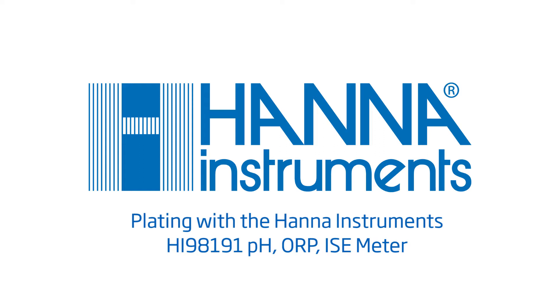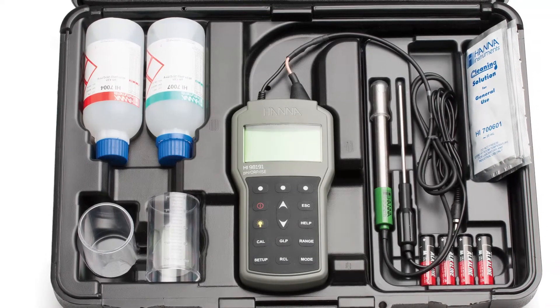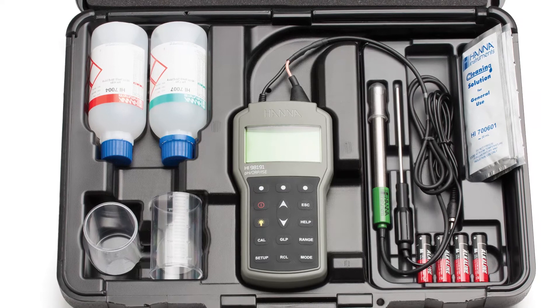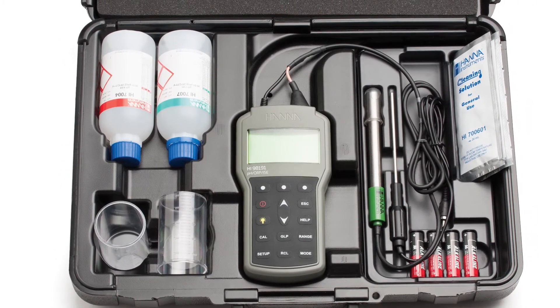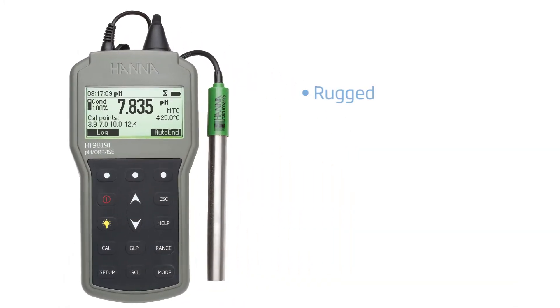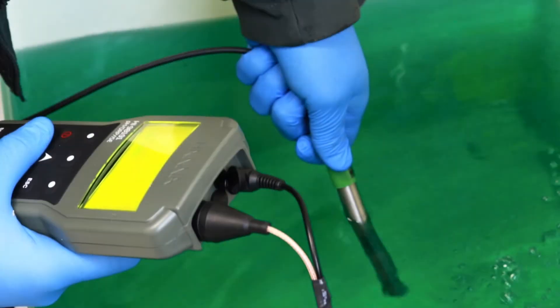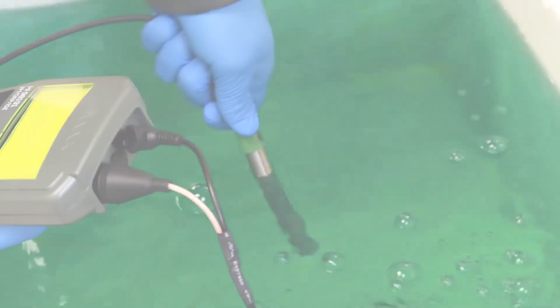The Hanna HI98191 Professional Waterproof Portable pH/ORP/ISE Meter is an excellent choice for a plating shop looking for a rugged, waterproof meter with the performance of benchtop instrumentation and the convenience of a portable device. Designed and manufactured to withstand the harshest of environments, the Hanna HI98191 will be able to move from analyzing samples in the lab to spot-checking plating baths on the shop floor.